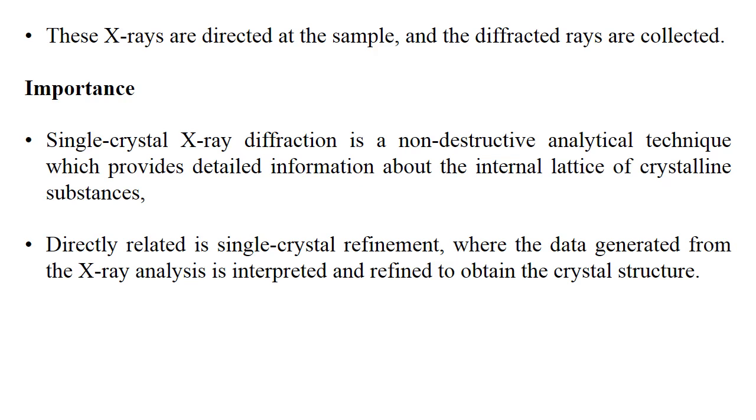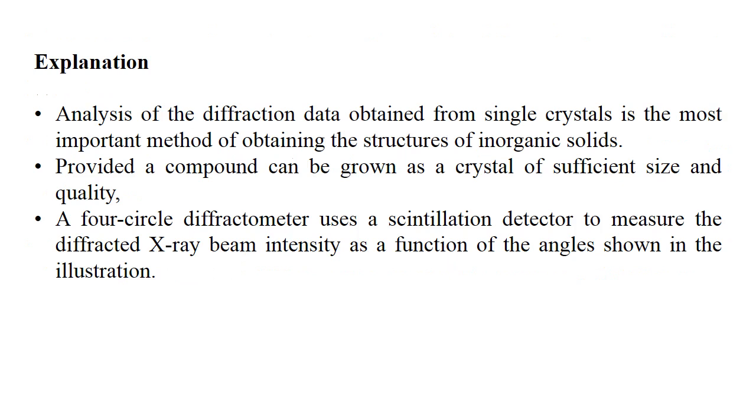We have discussed that the X-ray diffraction technique is very advanced and very comfortable and useful compared to NMR, IR, and mass spectrometry. Explanation. Analysis of the diffraction data obtained from single crystals is the most important method of obtaining the structures of inorganic solids.